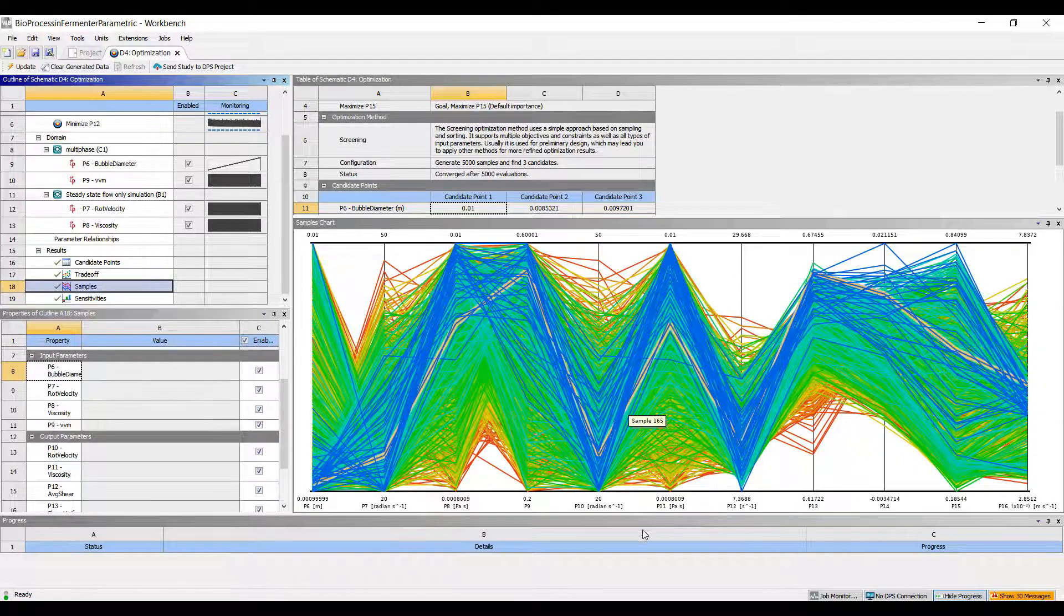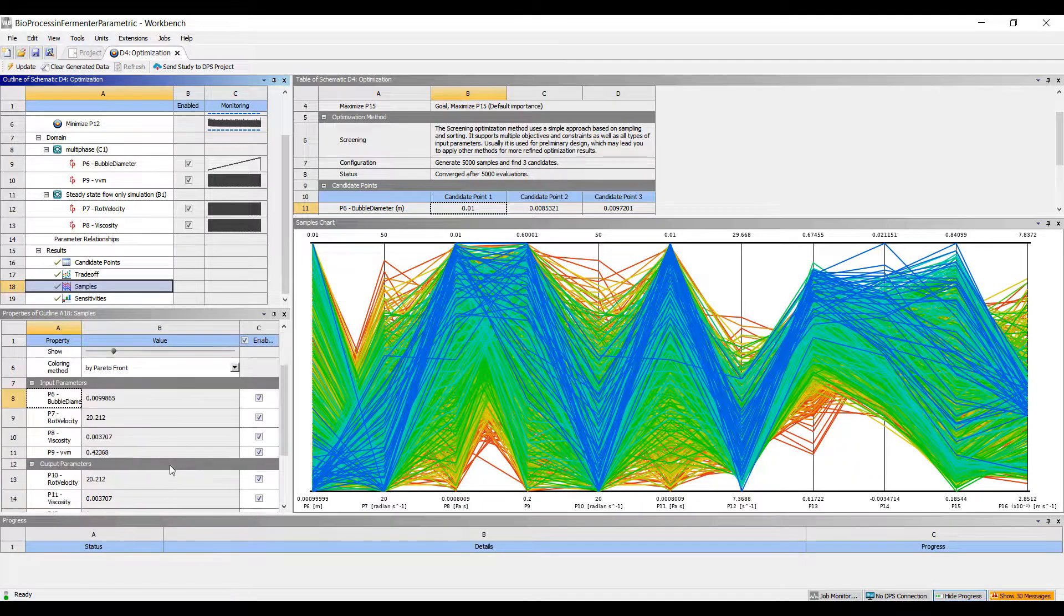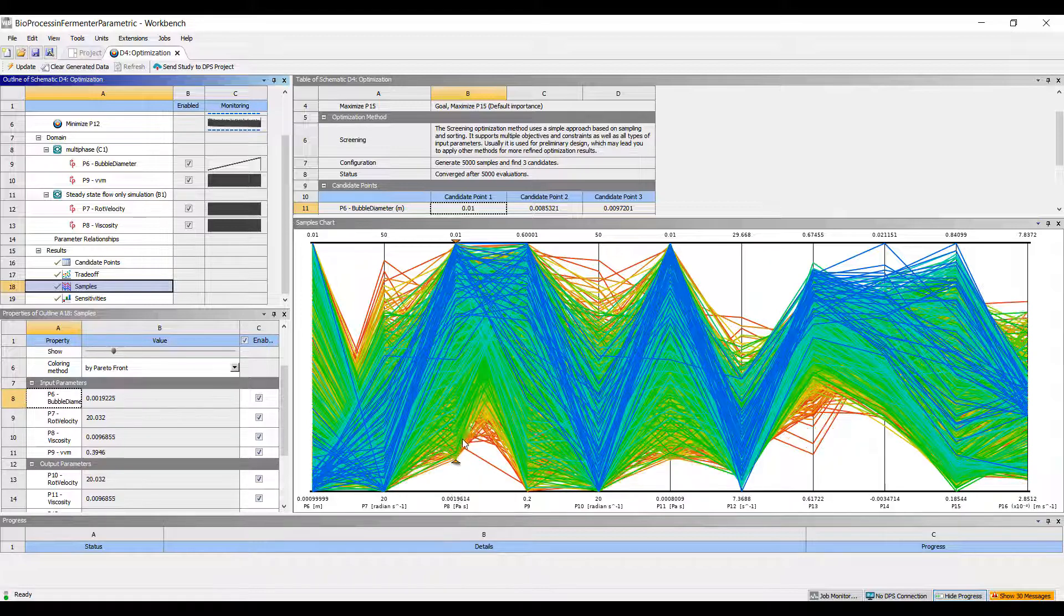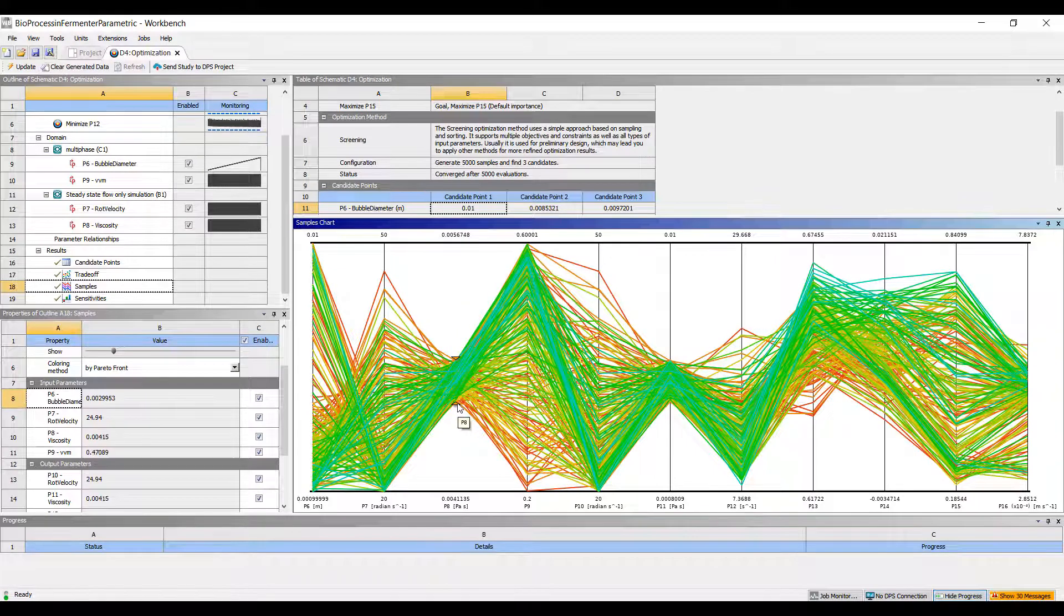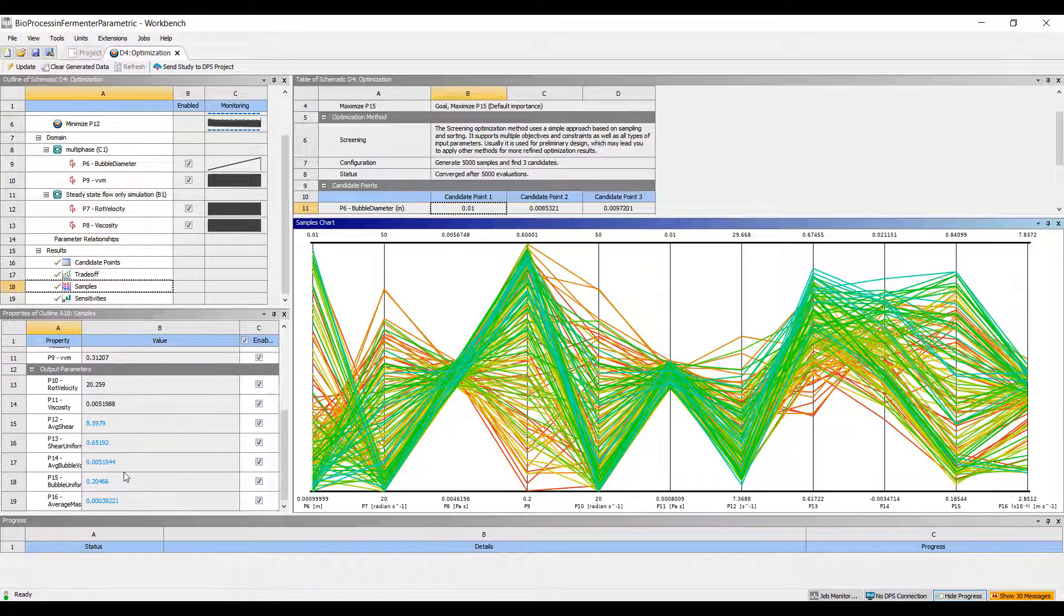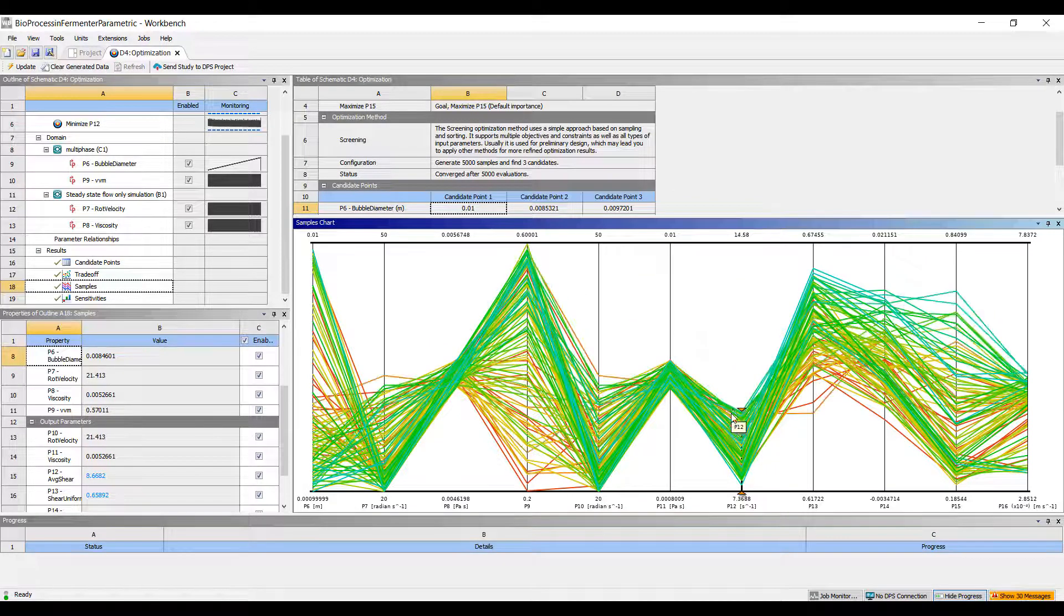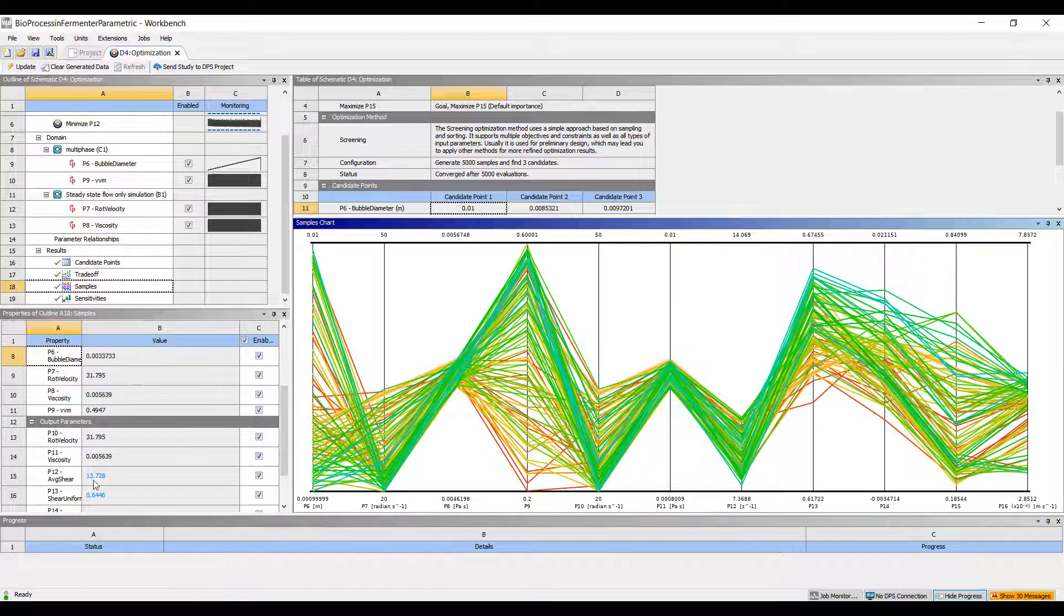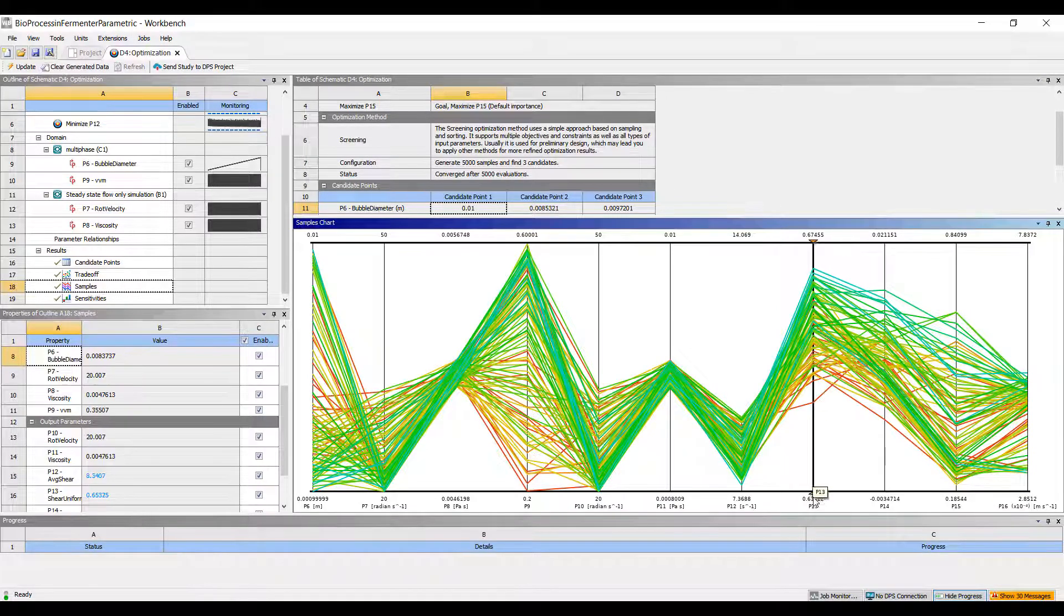The sample plot allows us to filter out designs. Like I mentioned earlier, we may want to specify the viscosity, which is P8 here. If you know what the viscosity of your system is, we can just remove all the designs where the behavior is outside of that viscosity. Then we can start tuning this. Maybe we want to make sure the average shear rate is below a certain value, that's P12. Let's get rid of the lower values of average shear. We want to also make sure the shear is fairly uniform, so we want this as uniform as possible, so let's get rid of the lower numbers.